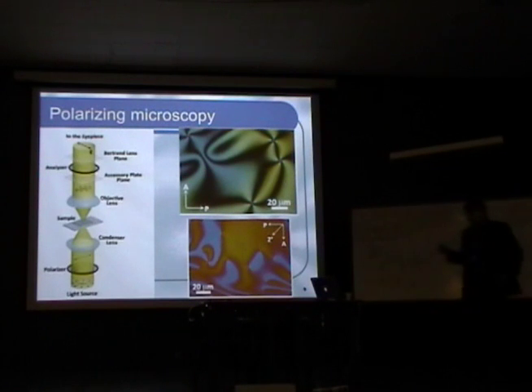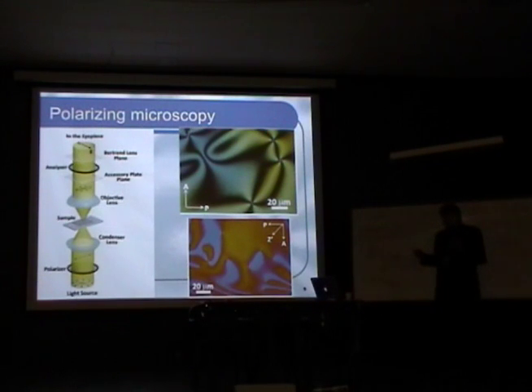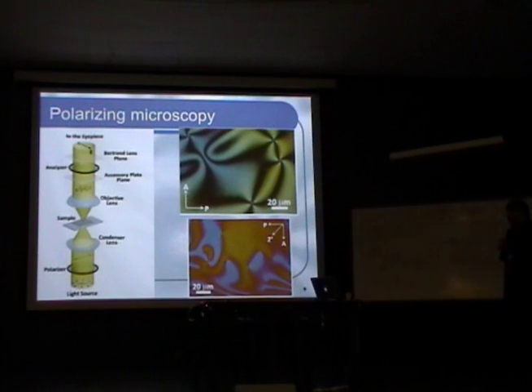And then we can probe the phase retardation of light that is due to the sample that we study and the phase retardation of light due to the birefringent plate that we use as an accessory plate. How do they add or subtract? By probing that, we can figure out whether, in those dark brushes, the optical axis is parallel to the polarizer or analyzer, and we can unambiguously determine the orientation of the optical axis and director of the liquid crystal.